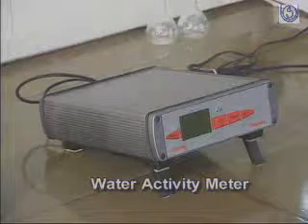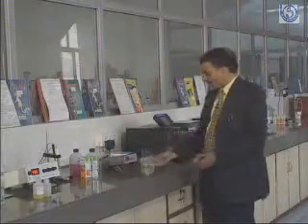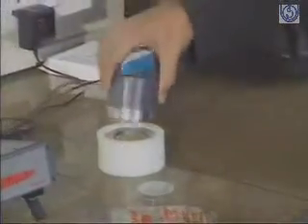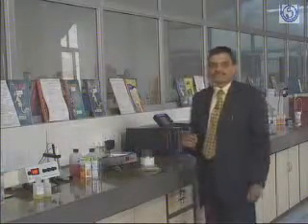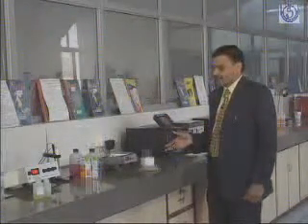This is the water activity meter, where we can get the water activity of a product. Say this is the moong dal sample, we have to crush it, we have to put it into the cuvette, and then we put it into this sample cell, and after that we put in this hygrometer, and we can read the water activity. This indicates the probability of the presence of pathogens in a particular sample.